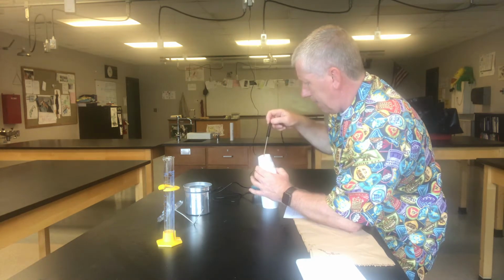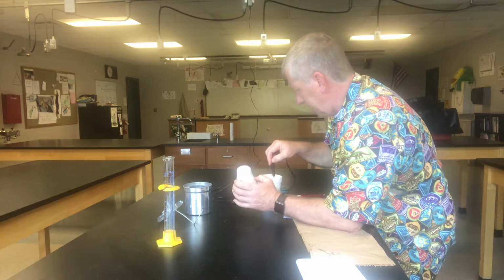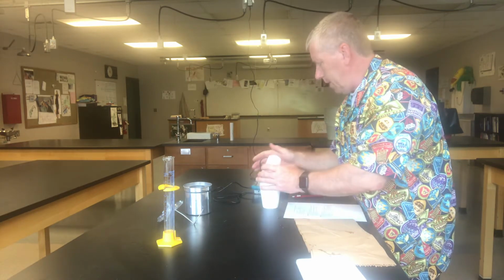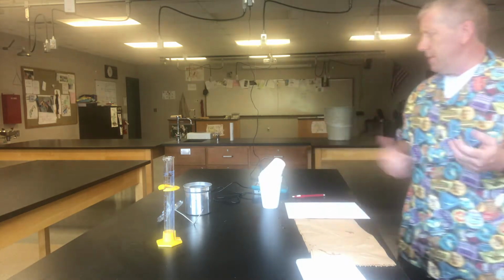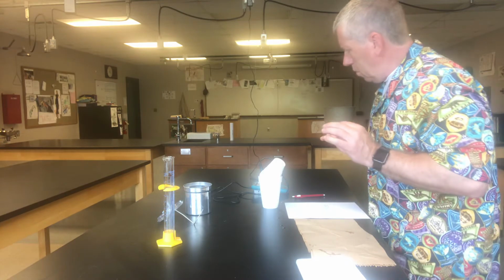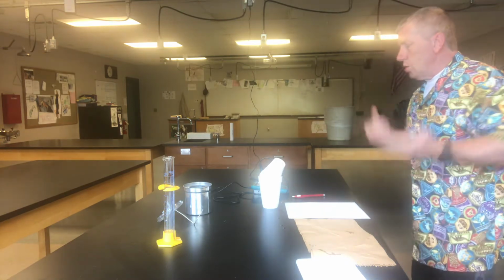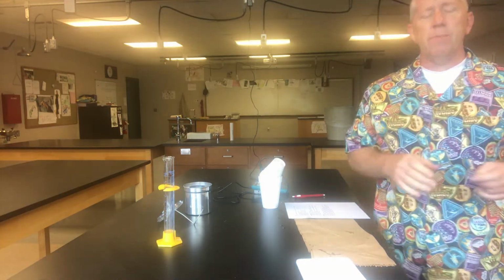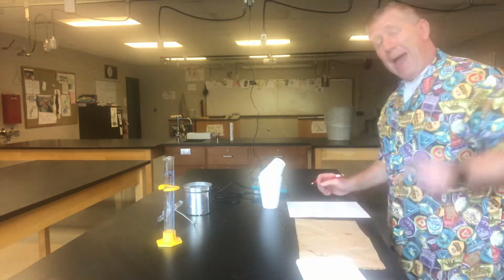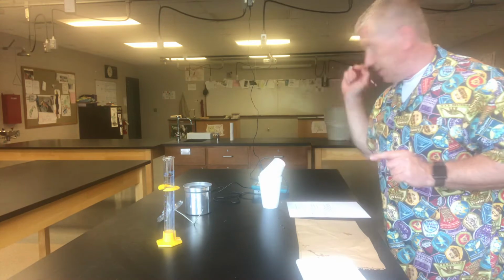I'm going to do a last minute mixing and get a temperature reading, and then we're done. Now at this point, we do have to take the top off at times. 18.5 seems to be where we stabilized. So yeah, 18.5 degrees is our final temperature. It's called the equilibrium temperature. So the temperature of the water after the ice is added is still at 18.5.